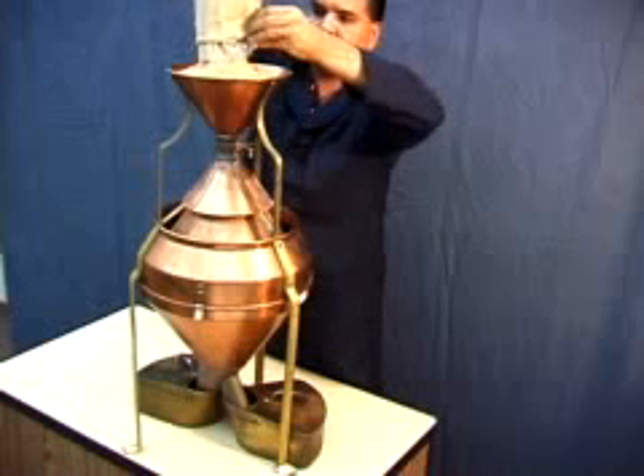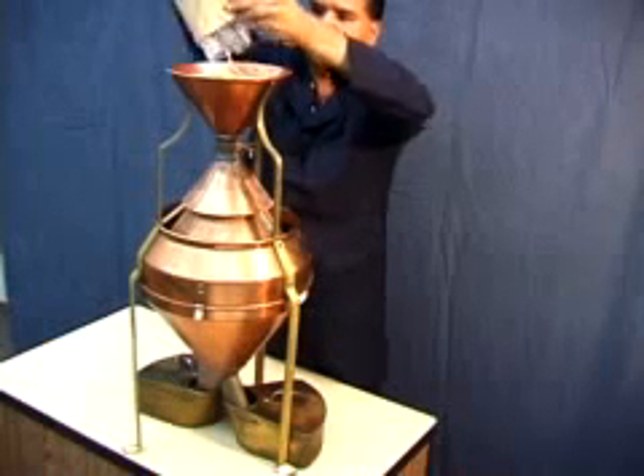For larger samples, feed more grain into the hopper during the dividing process.